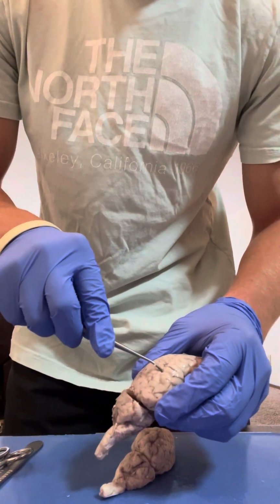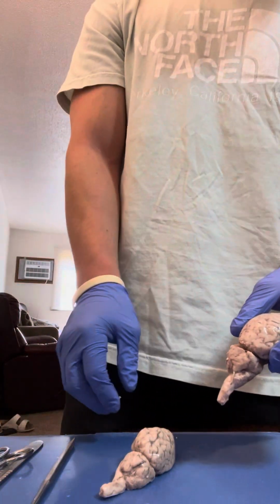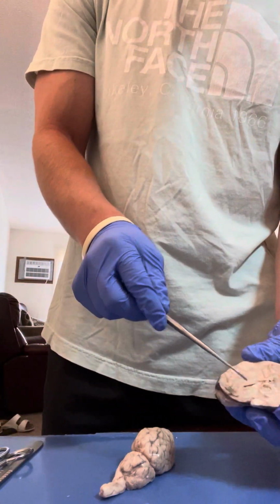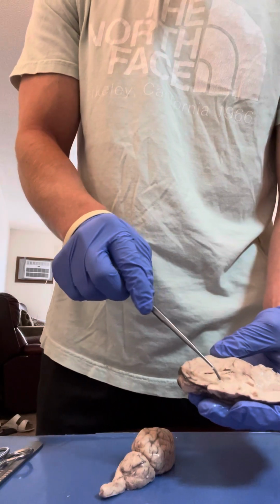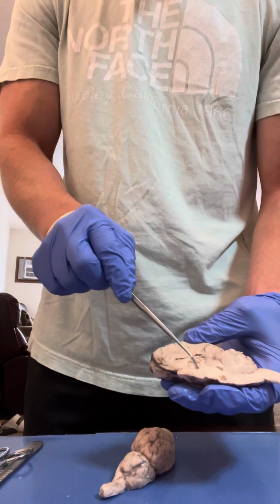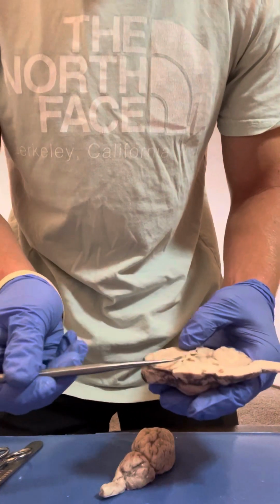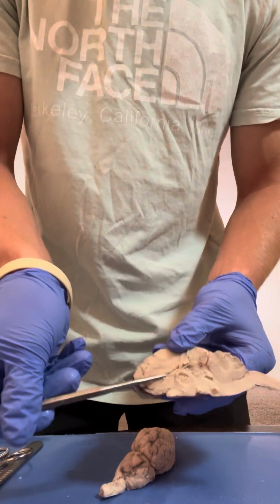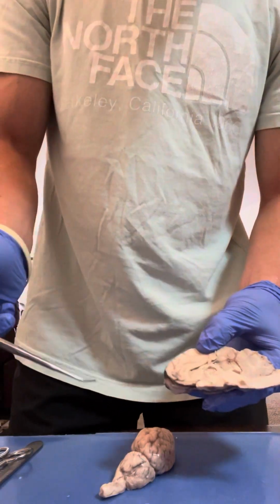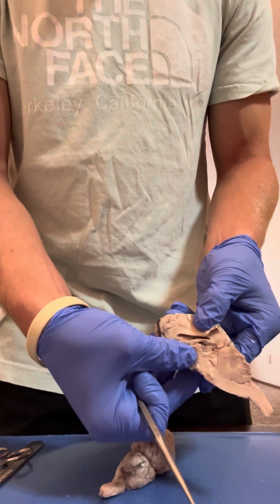I can drag my tool down through there. Next we have the thalamus. So superior to the hypothalamus, it was kind of what I was referring to earlier with the middle part of the brain, fairly distinguishable. Next we have a ventricle. So as you can see, I can kind of stick my tweezer in here. These are important because they're filled with cerebrospinal fluid.